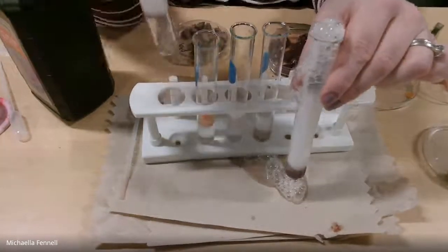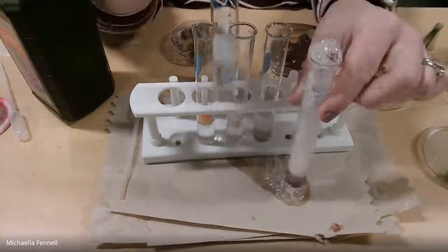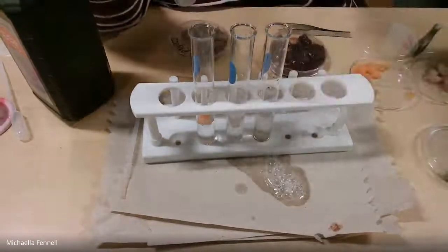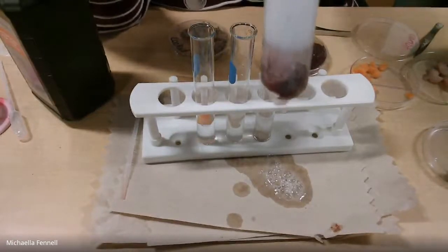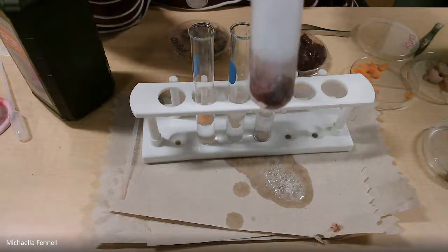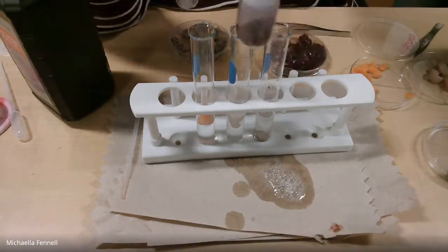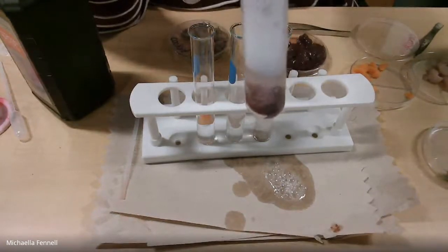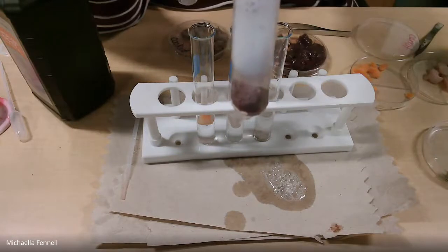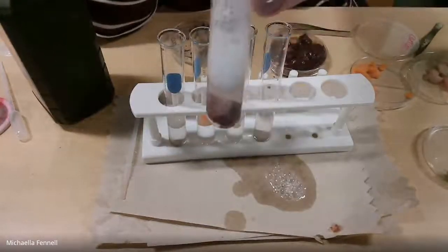By the way, our potato is still going here. Potato is still fizzing. This one's still going. I'm trying to get in front of the camera there. Will it focus? You can see the bubbles forming. Kind of interesting to look at it in the test tube. The bubbles keep forming on the surface of the liver, and it'll just go and go and go. By the way, the test tube gets warm. This is what we call an exothermic reaction. This gives off energy, so it will actually also make the test tube warm.